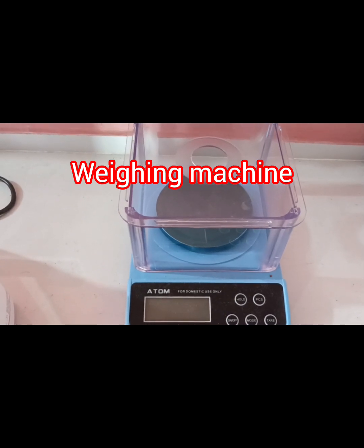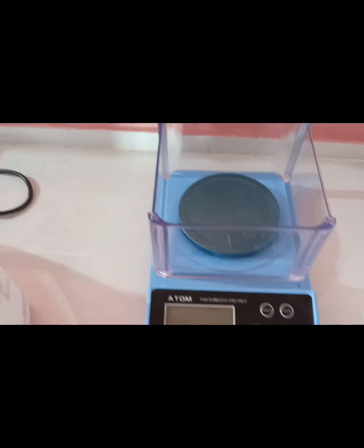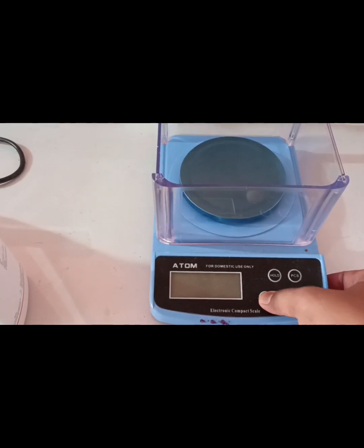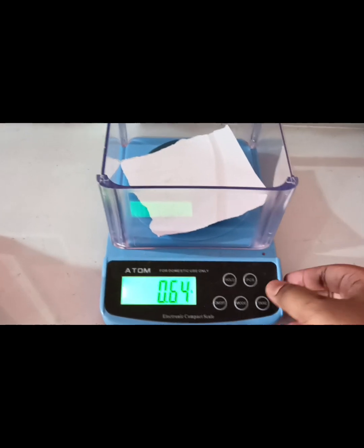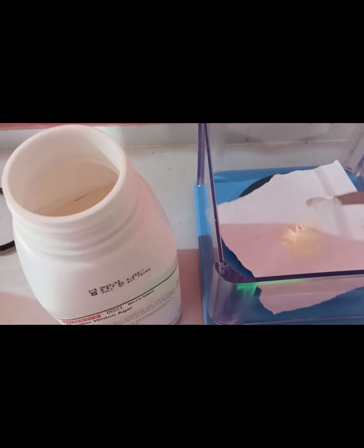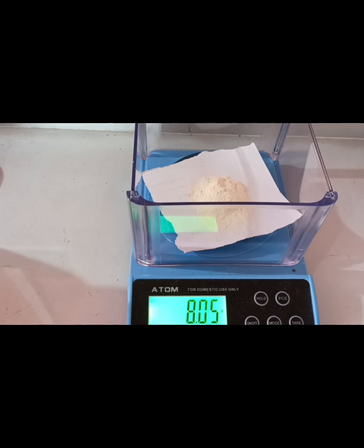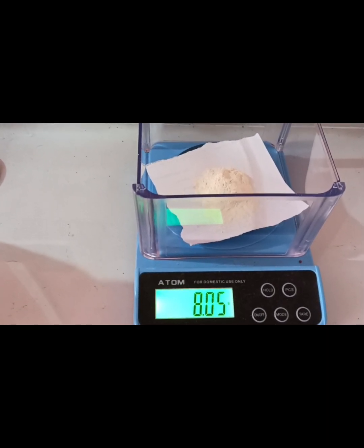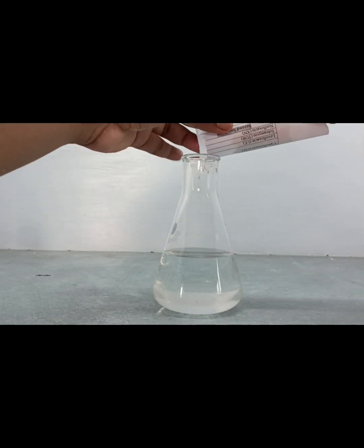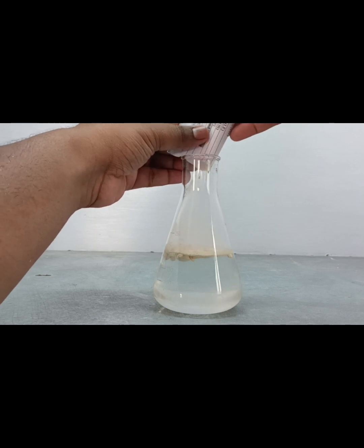We have to measure the agar powder using the weighing machine. First we open the lid and switch on the weighing machine. After that, place a paper on it and set to zero. We are measuring Mueller Hinton agar powder and finally taking 8 grams of Mueller Hinton agar powder.